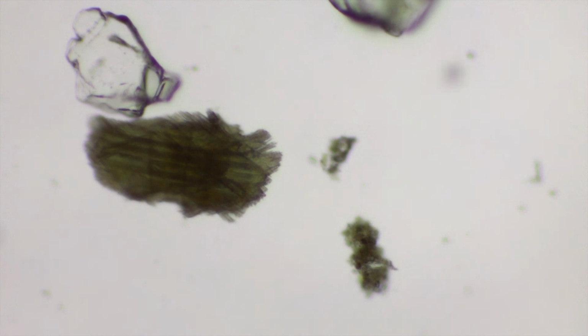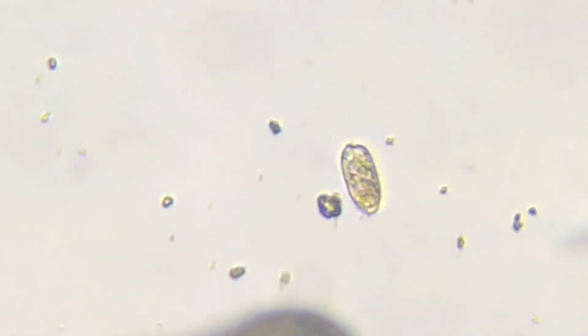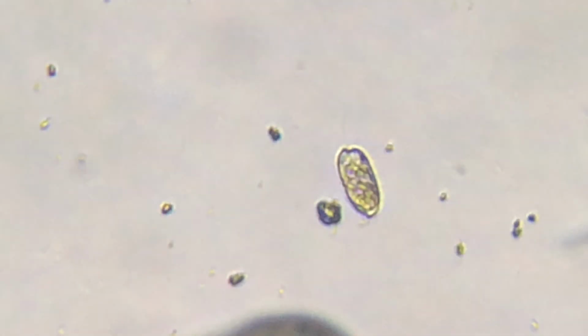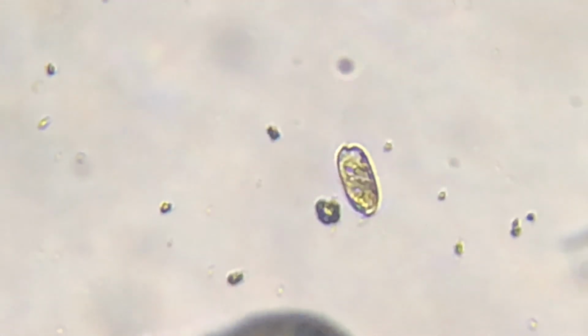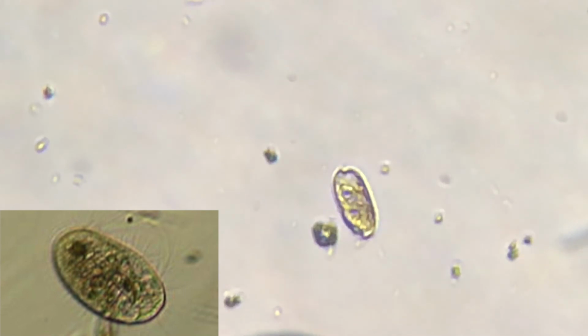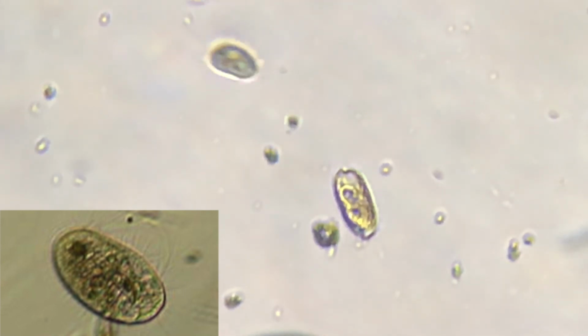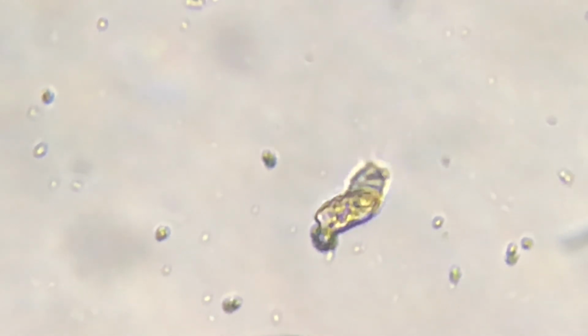The vast majority of organisms I encountered were too fast to capture and appeared to move by jumping, very similar to the Stylonychia I encountered. When placed in a 3% methyl cellulose solution, it was easier to identify these fast-moving ciliates as Pleuronema. They are free-living, oval-shaped, and are known to move in jumps. Some eat bacteria and algae as well as smaller diatoms.